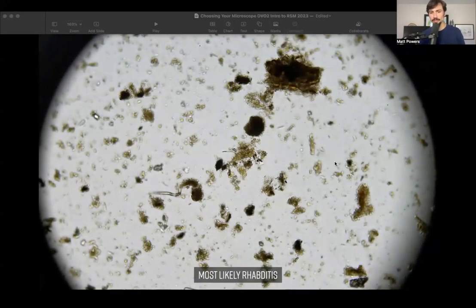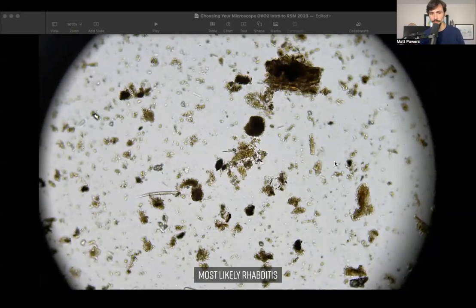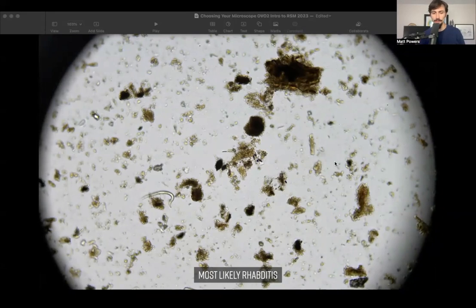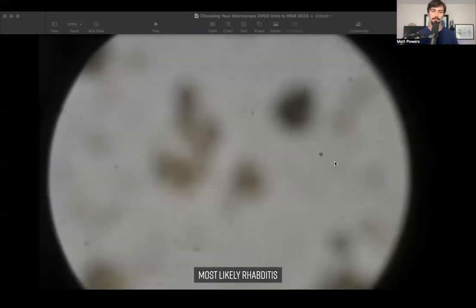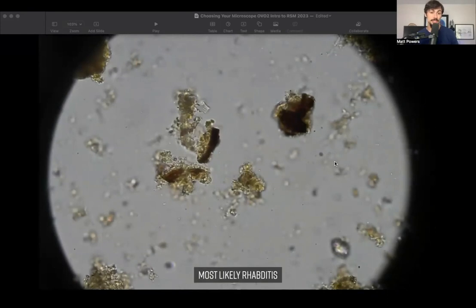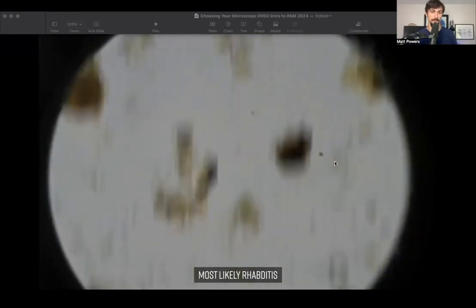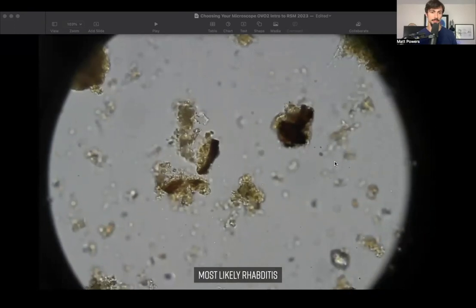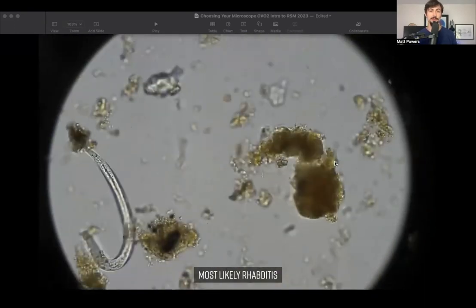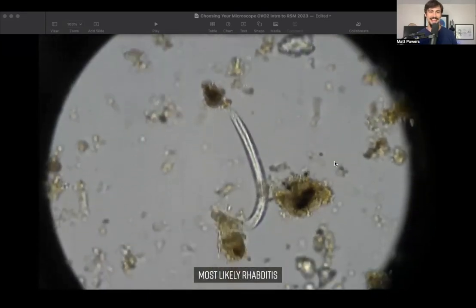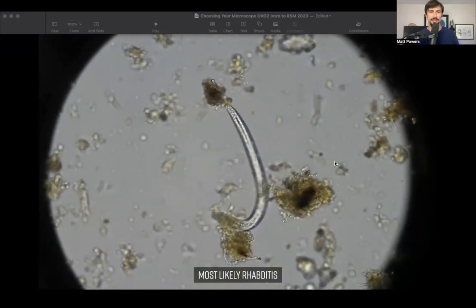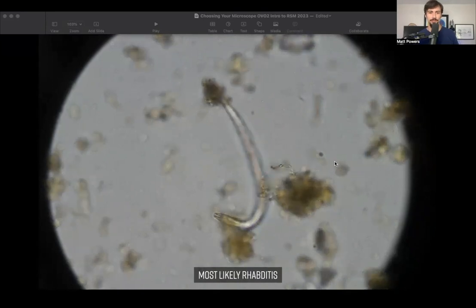This is 40, this is 100, this is 100. Look at the difference between this 100x and the 100x we were looking at before. This is a bacterial feeder as you'll see in a moment, but it's most likely Rhabditis. But because there's millions of species, we have to always be tentative about our conclusions in this space. As you can see, as we get closer, now we're at 400x.